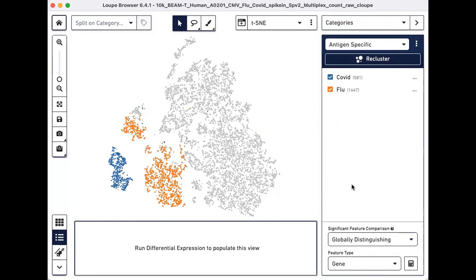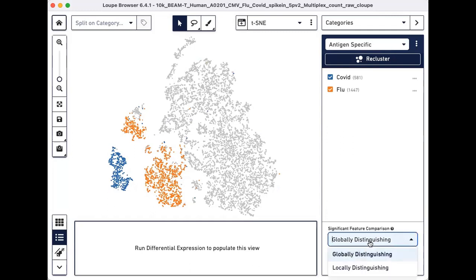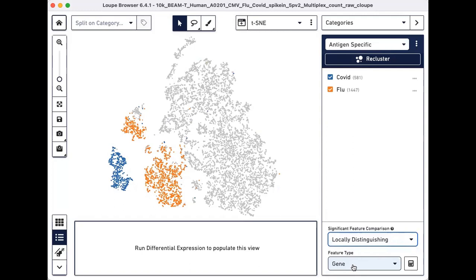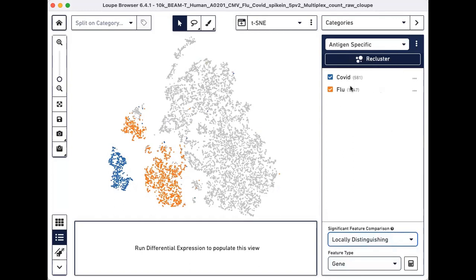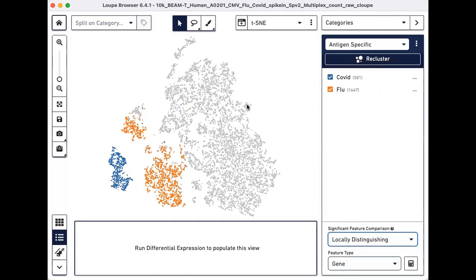Finally, we will perform differential gene expression analysis to identify genes that distinguish flu reactive cells from COVID reactive cells. Click on the Significant Feature Comparison drop-down menu and select Locally Distinguishing. This selection helps identify genes that are significantly different between the two checked groups in the selected category as opposed to between the rest of the cells in the data set.